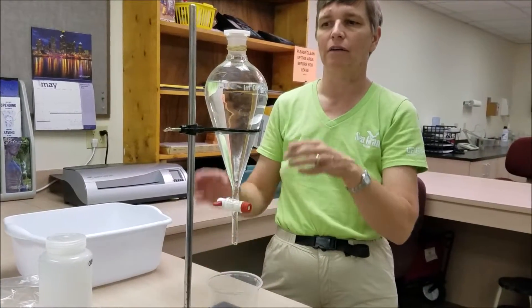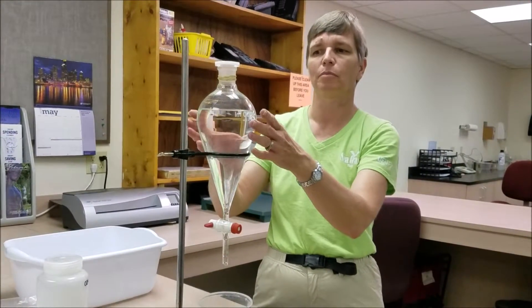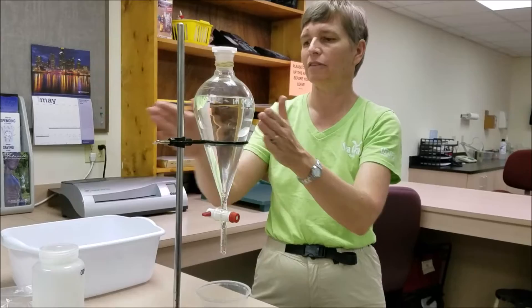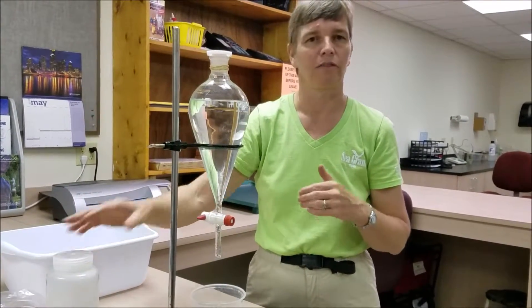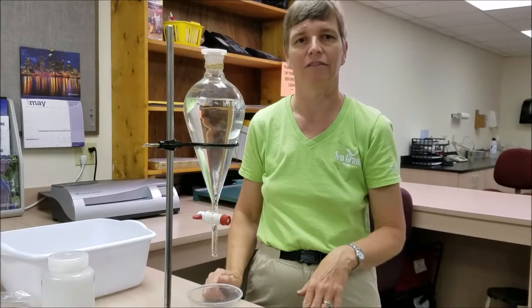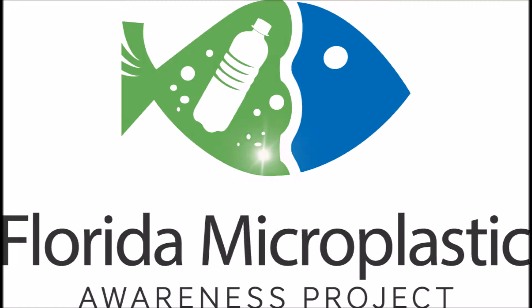We're now ready to take our sample and filter it. We'll simply pour it straight from the separatory funnel instead of pouring it from the sample collection bottle. Otherwise the filtration process is exactly the same as with any other sample.